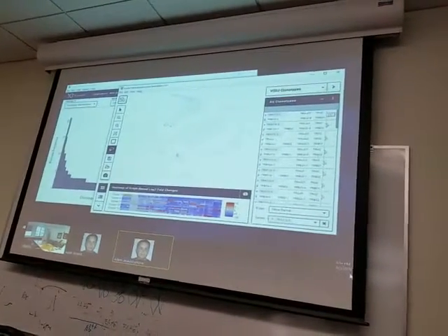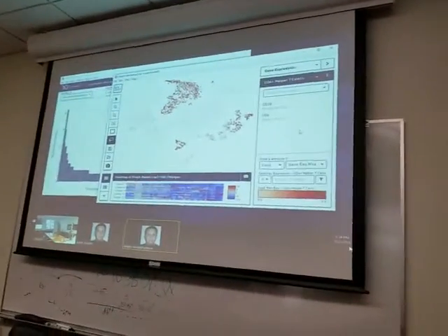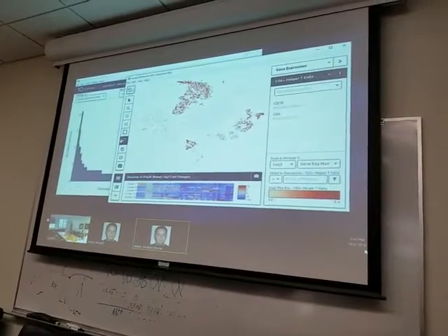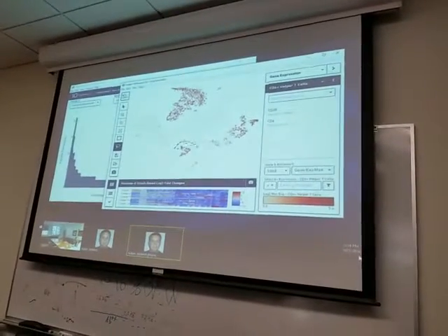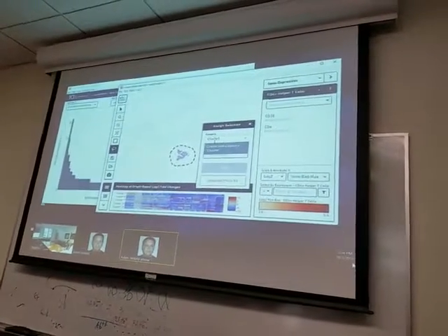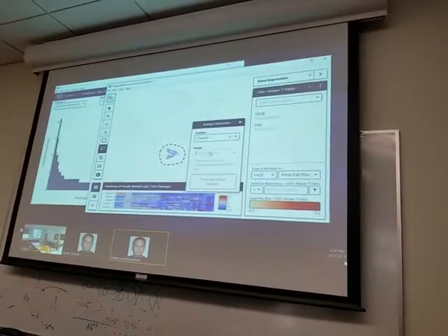Can you do that? The other thing we can do is the reverse way. If I go back to gene expression, and let's just say I have no idea what this is, but I'm super interested in this cluster because it has certain markers that are important to me.